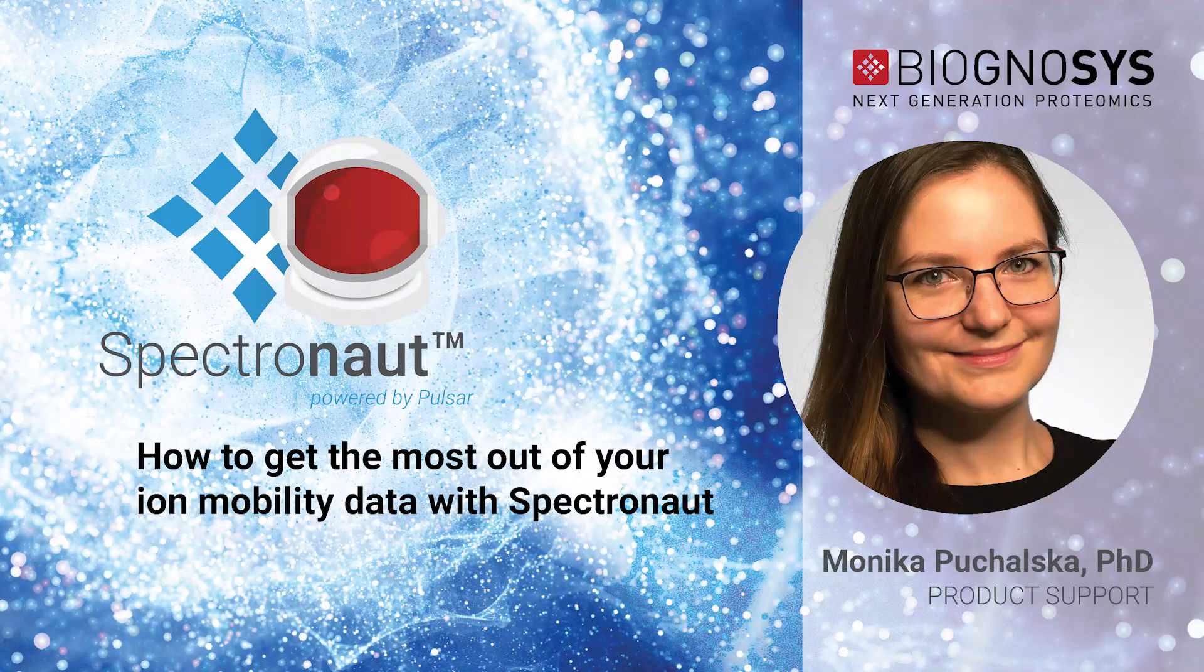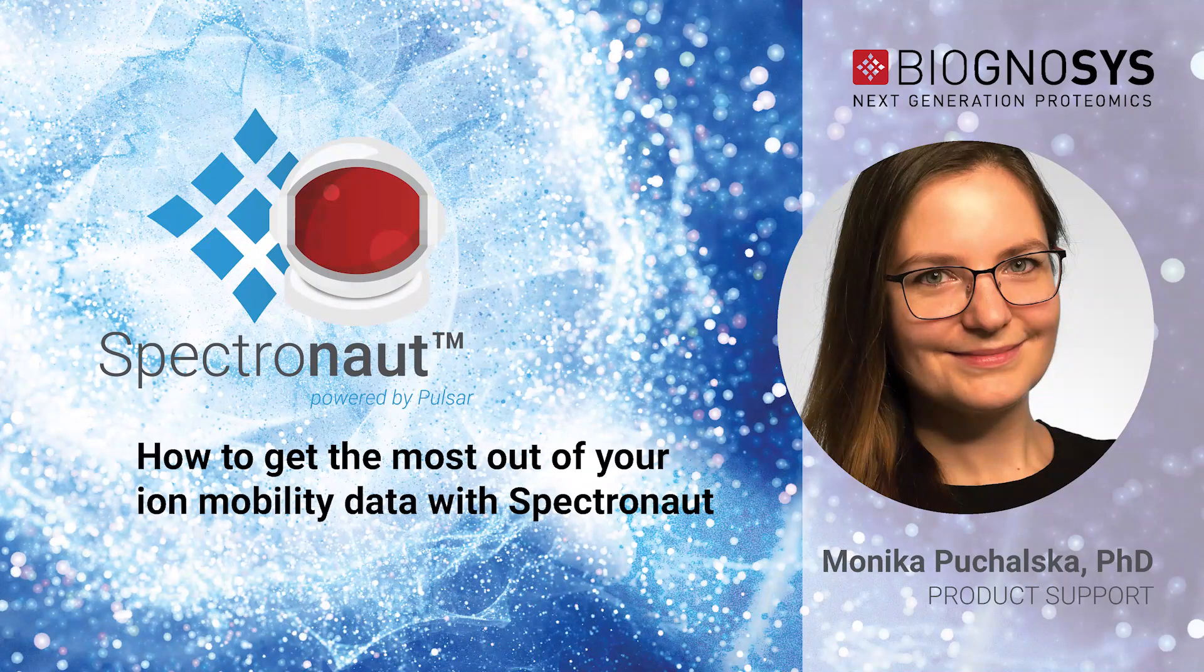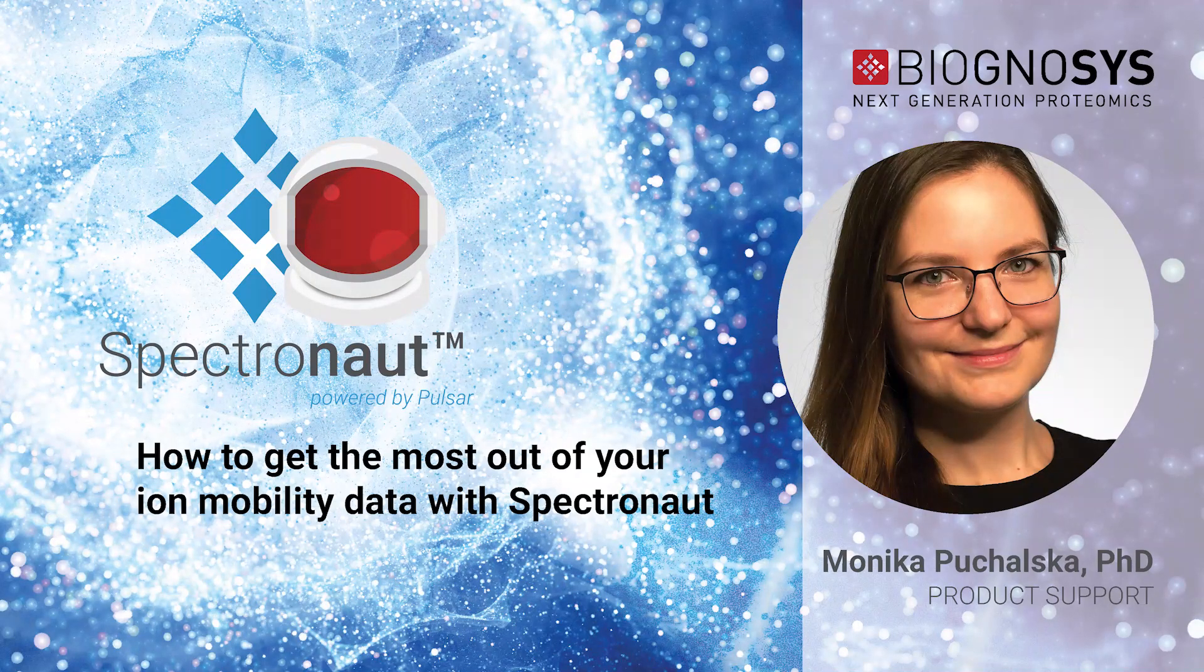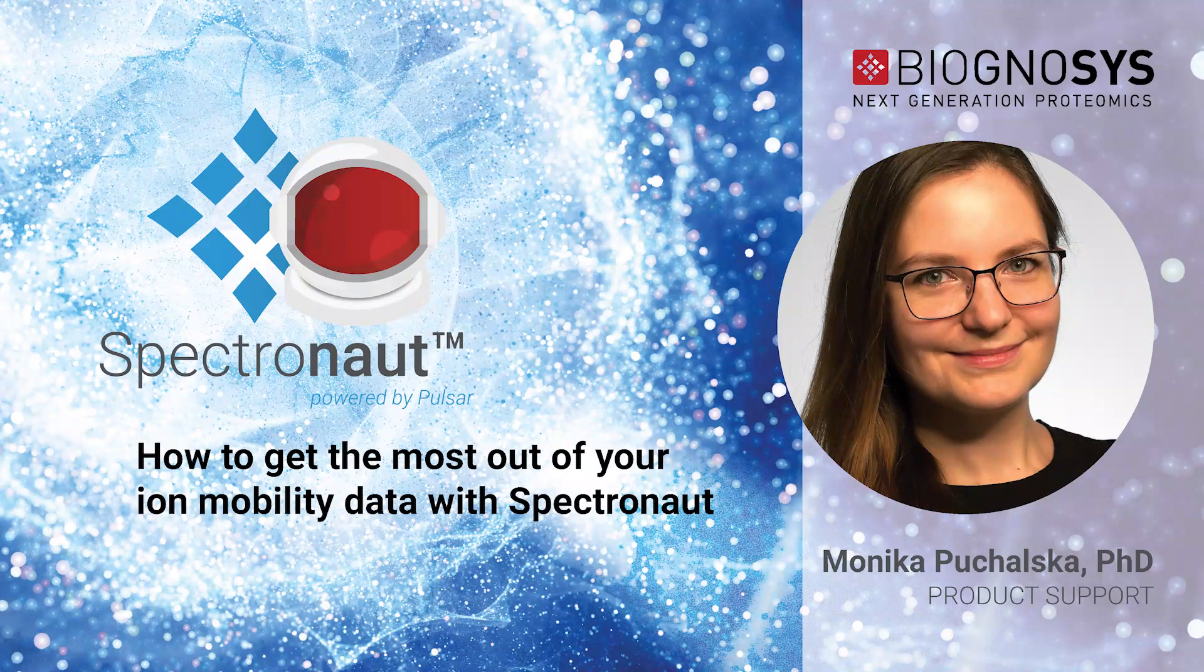I will show you how Spectronaut supports ion mobility data from different vendors, as well as new graphs in Spectronaut that are dedicated to ion mobility data visualization.